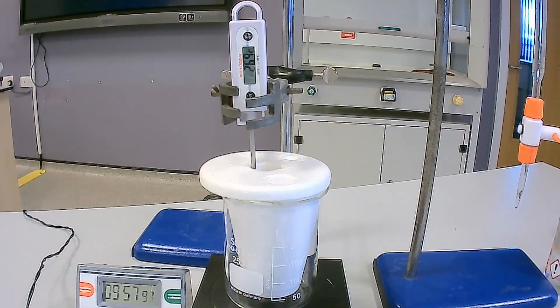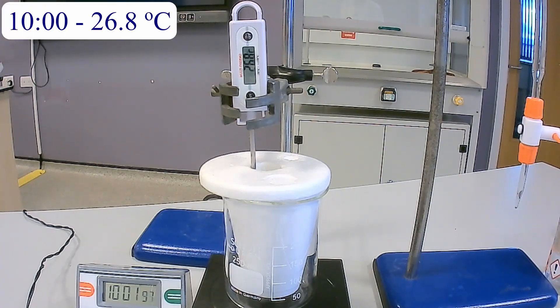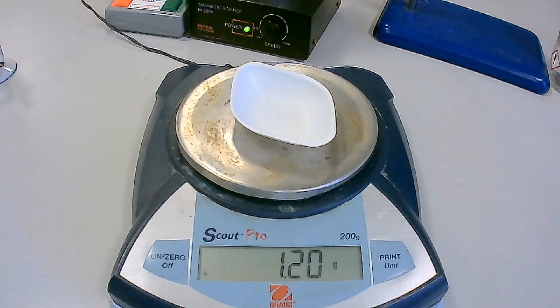At 10 minutes you can finish recording the results and you can stop this experiment. Ensure that you record the final mass of the weighing boat after transferring the anhydrous sodium carbonate to the polystyrene cup at 4 minutes.